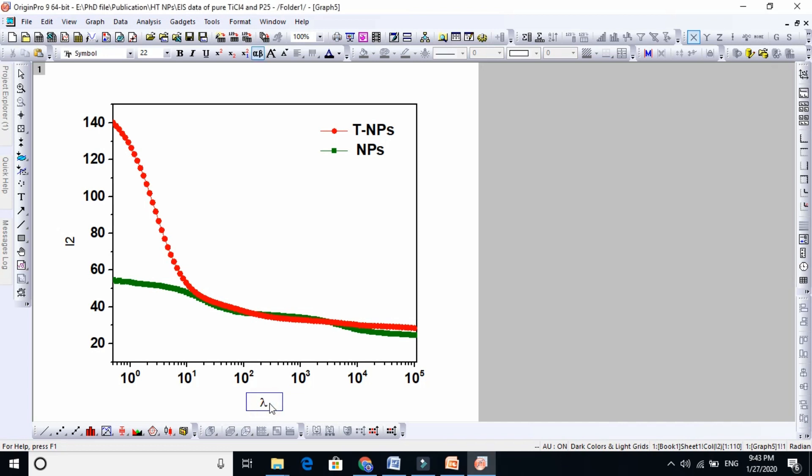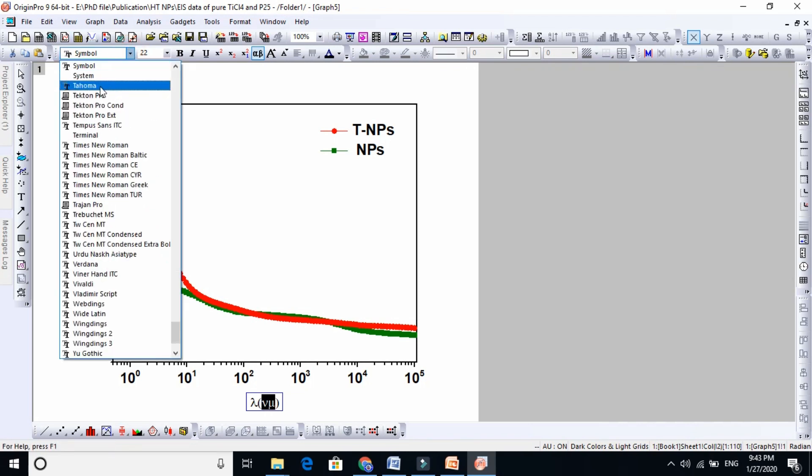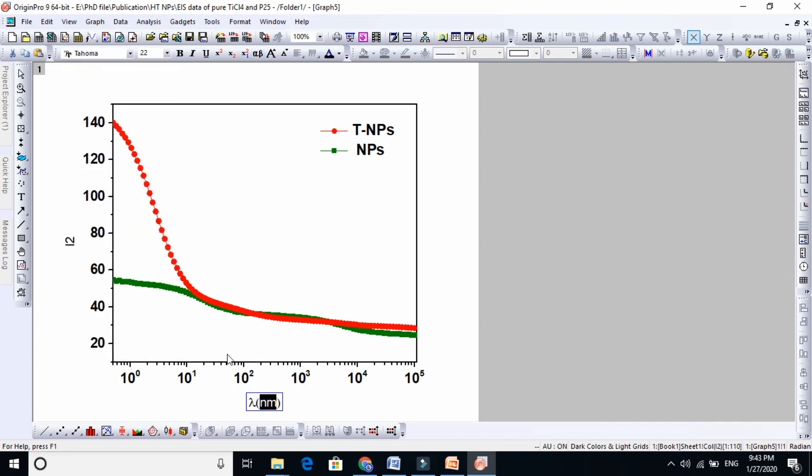If you want to use the unit in nanometer, just write here nanometer. But this is now in symbol form, so you need to change this symbol from this place into text here, and any kind of text you can use: Times New Roman or Tahoma. Now it is here, you see.